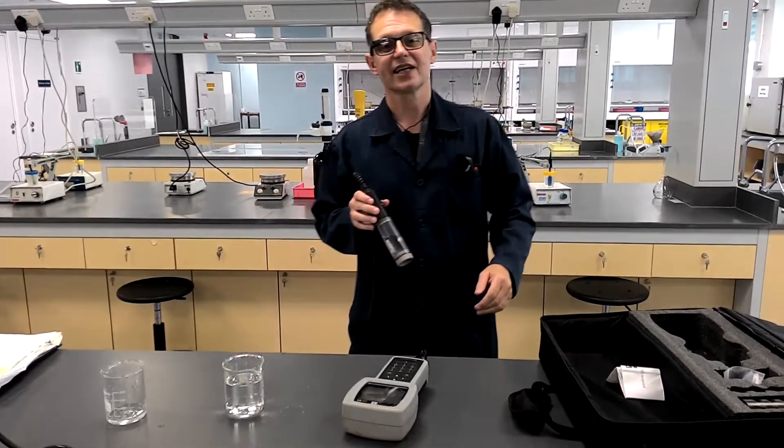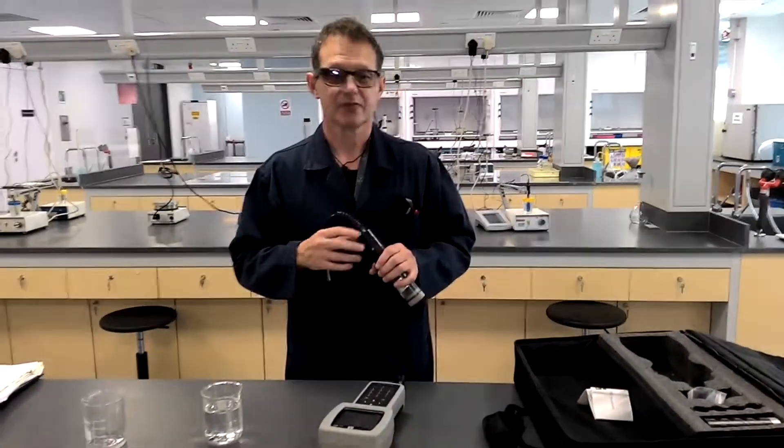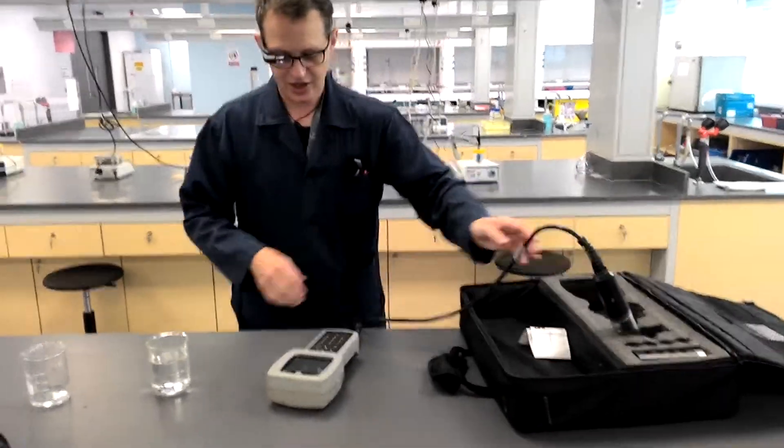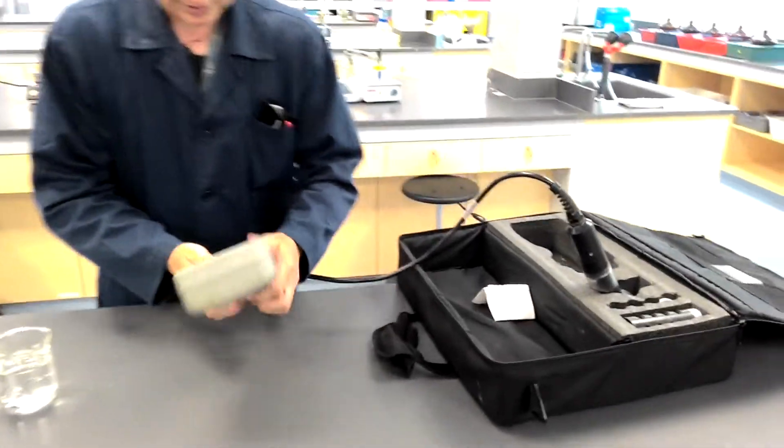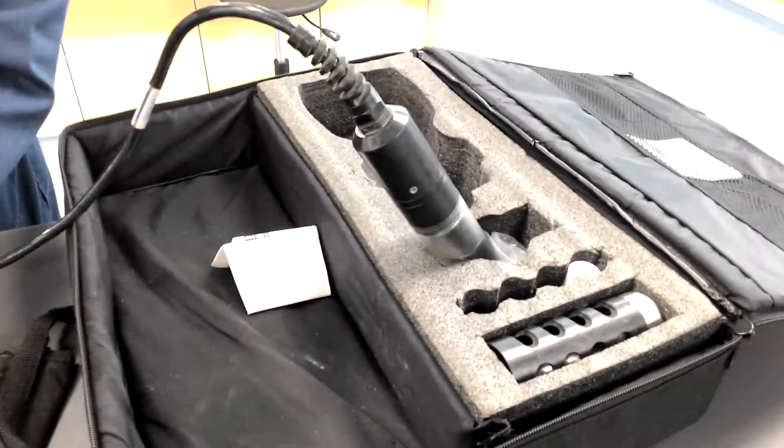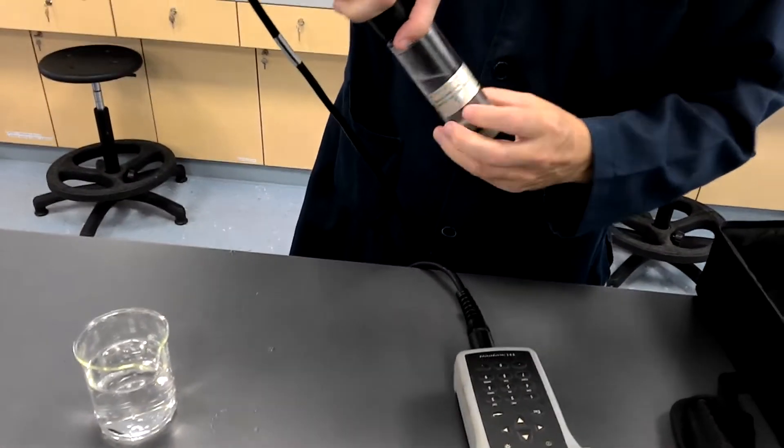Anyway, thank you very much. We'll move on. OK, Simon, I have a question. So maybe we'll do it like a small conversation as we are recording it. Of course. This instrument reminds me of a pH probe where the sensors need to be stored in some liquid. Could we elaborate why are we using certain liquid there? Could it be pure water, distilled water or saline, which is the best and why is it so?